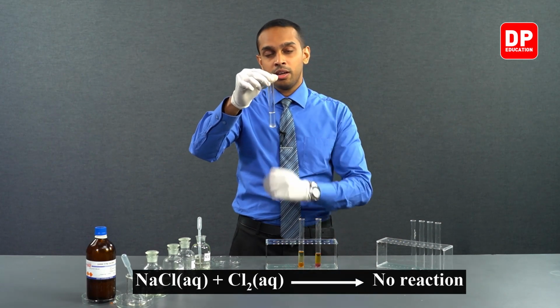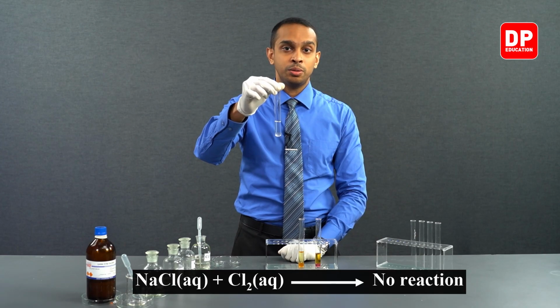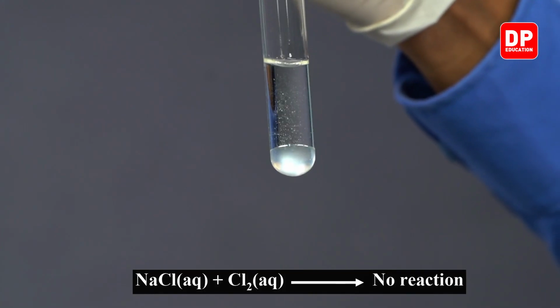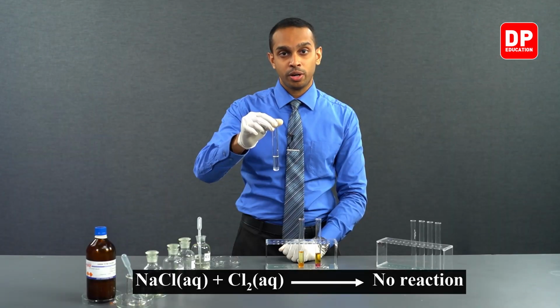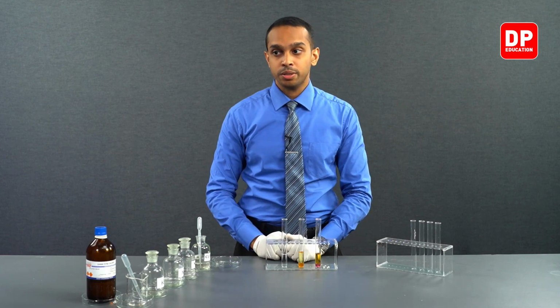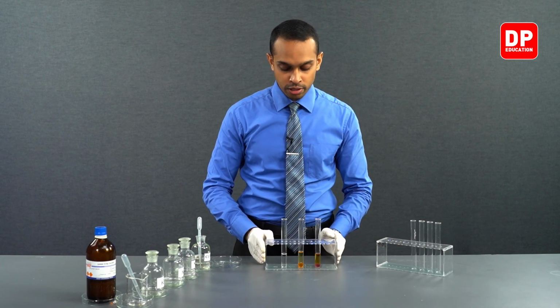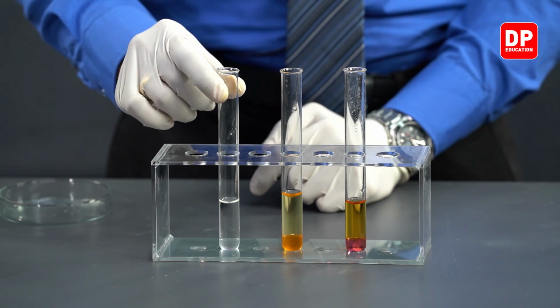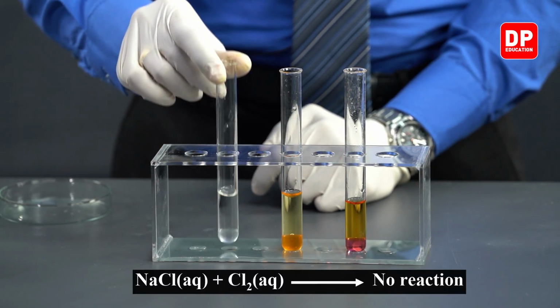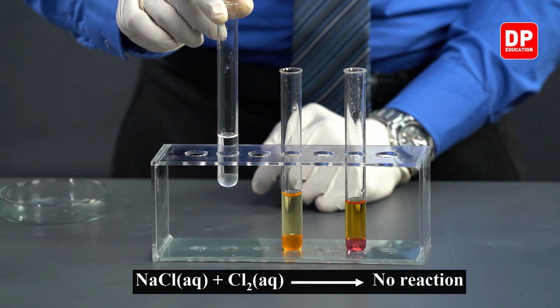So when you do the chlorine water test to chloride ions, the observation would be no change upon addition of chlorine water to a chloride ion solution. So let's focus on the summary of this test. When we add chlorine water to a chloride ion solution, we observed no change.